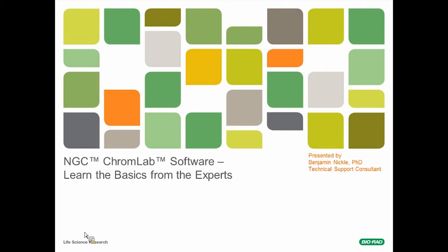For today's presentation, we'll be using version 3.1 of the ChromLab software. ChromLab is a software package that works with the Bio-Rad NGC system to develop, organize, and run chromatography methods, as well as collect and analyze the resulting data. The software is designed to make operating the NGC system and analyzing the data easy and intuitive.